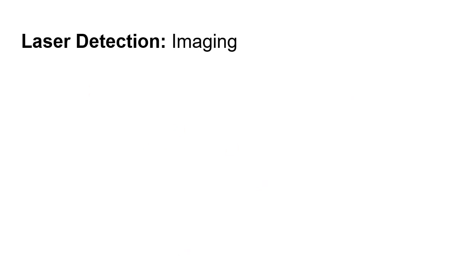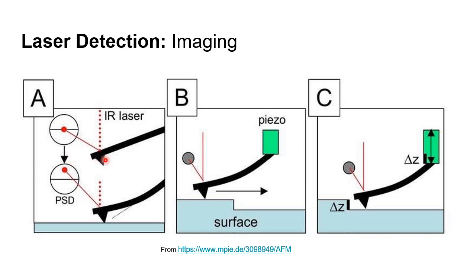Understanding the steps mentioned before is very important because they are very relevant for the imaging in AFM. Here you have the aligned AFM, in which the laser falls directly into the center of the detection. If the cantilever bends or is deflected, the light will fall somewhere else. This occurs as the cantilever moves across the surface of the sample, and it can be realigned into the center of the detector using the piezoelectric attached at the end of the cantilever.